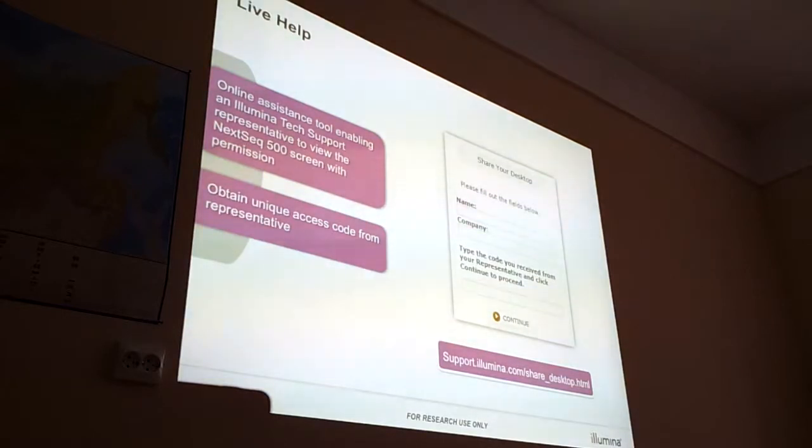Yes, so actually we have similar. It is installed on the NextSeq. So we have a different software, we call it GoToAssist. It is in principle the same as TeamViewer, but we don't use TeamViewer. Okay. So I will show you how to.